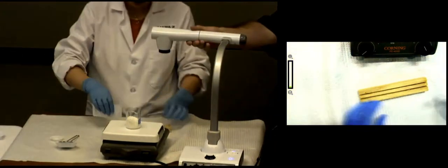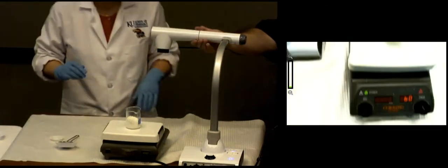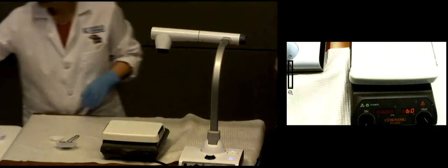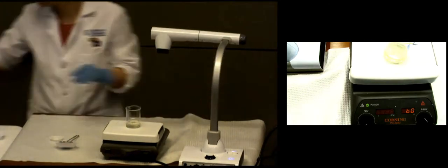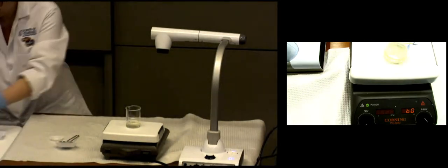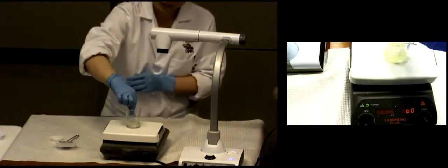Okay, so let's set up. Okay, by sliding and set this on the side. Okay, 20 minutes later, liquefy. We actually rehearsed that. We rehearsed a couple times. All right, so now we are going to add a stir bar.